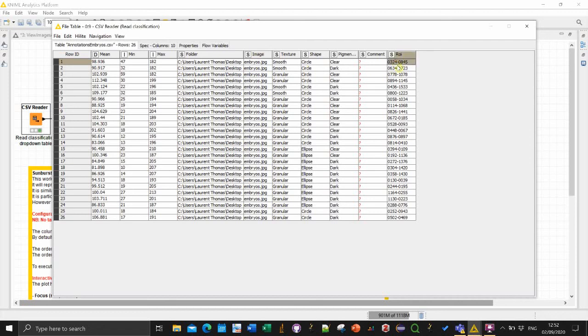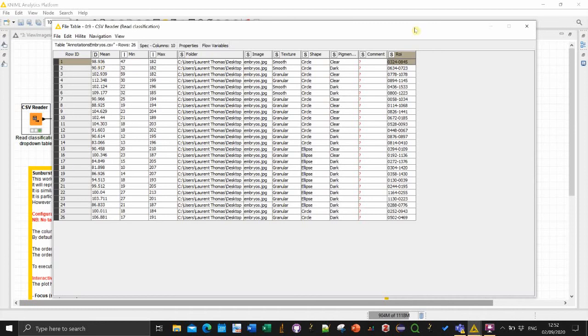You also have their ROI identifiers referring to the ImageJ ROI that we used to outline the individual embryos and also some measurement for the intensity. So for this embryo that was the average gray level, the minimum and the maximum gray level.